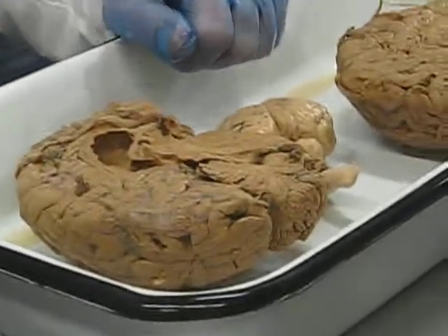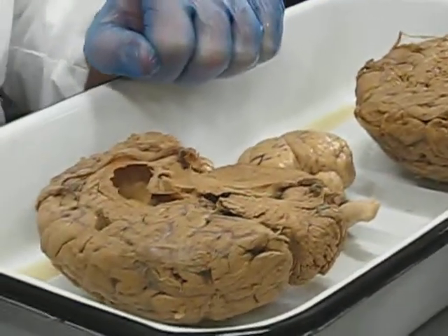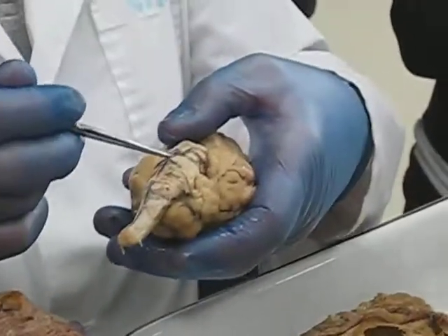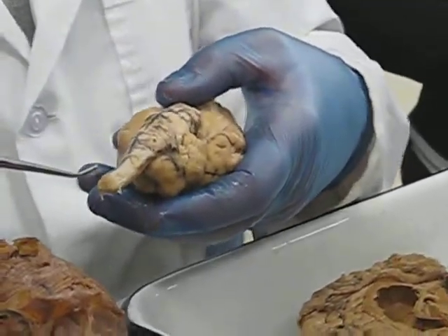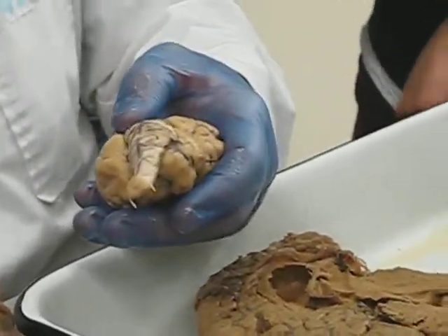The medulla oblongata, that's this right there. There's a ventral median fissure right here, running right along the ventral side, or on a human, the anterior side of the medulla oblongata, and then the spinal cord too. It's got a blood vessel in it here, so it looks black. This is it right there.